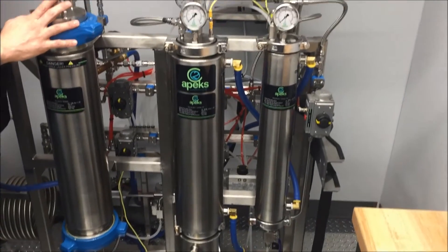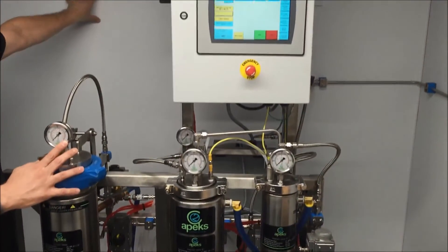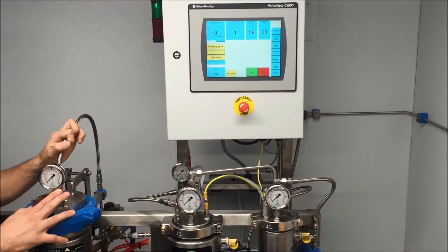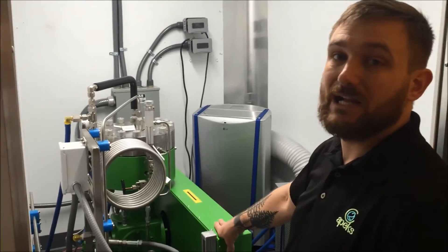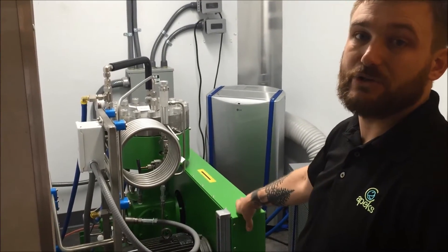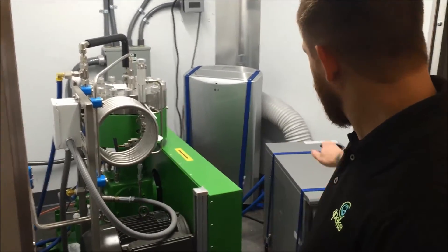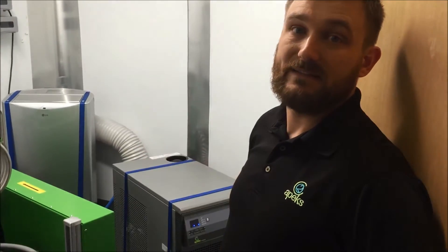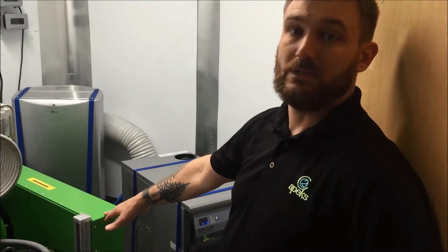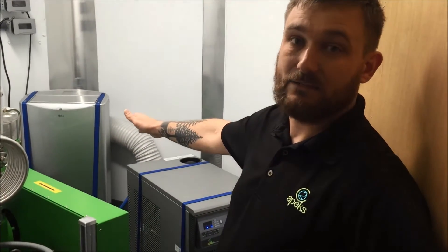In the other room back here we have our diaphragm pump and our chiller. In here we have our diaphragm pump — as mentioned, this is the most reliable pump on the market today for CO2 extraction systems. Over here is our chiller; this is what controls temperatures throughout all the vessels in the system and it also keeps our pump cool. Then we have our AC which is used to keep this room at the correct temperature.